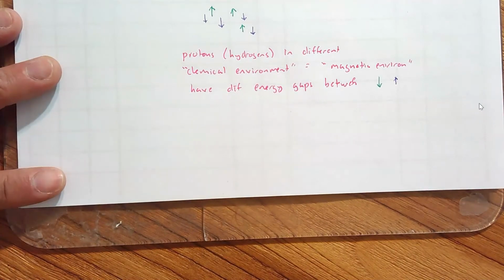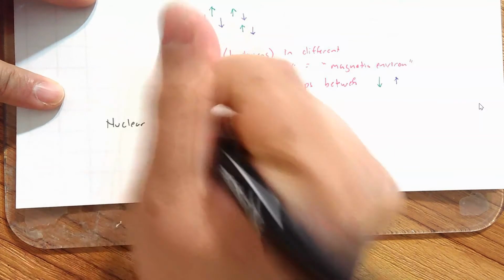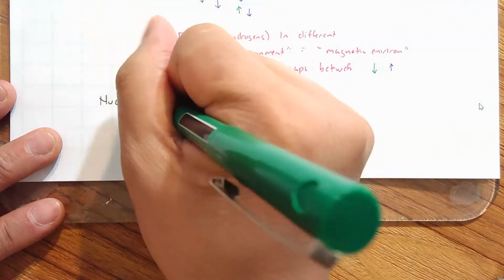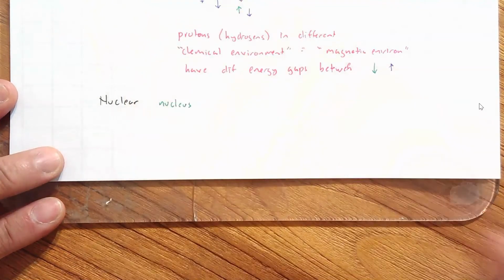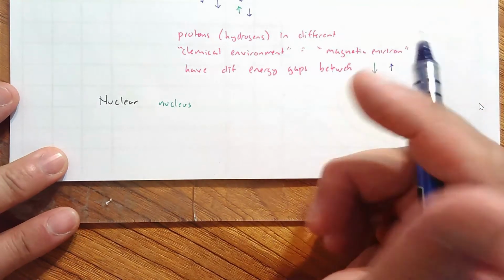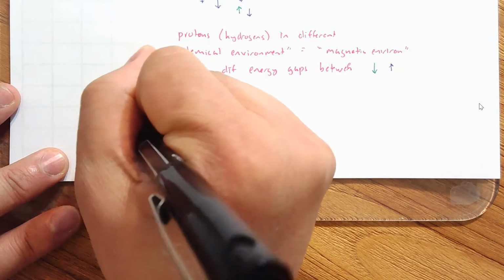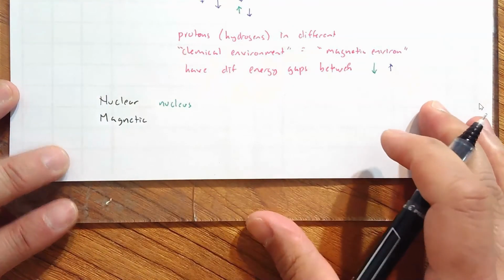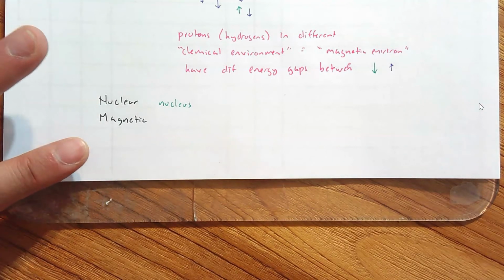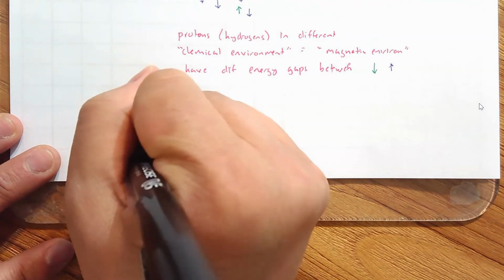Okay, the wording. Nuclear obviously refers to the nucleus of the hydrogen, which is a proton. Magnetic: to set up the experiment, we've put the sample in a magnetic field, and then we start flipping the protons with radiation. Resonance is an interesting word.